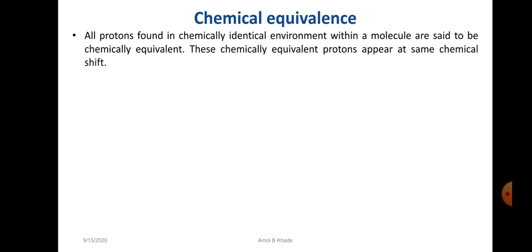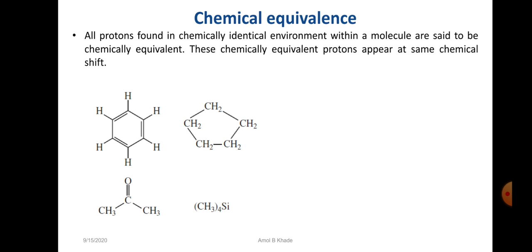Now this is what is called chemical equivalence. All protons found in a chemically identical environment within a molecule are said to be chemically equivalent. So these chemically equivalent protons appear at the same chemical shift, or the delta value.